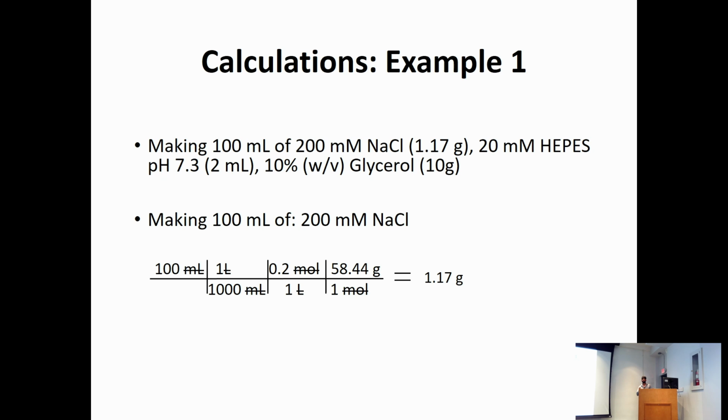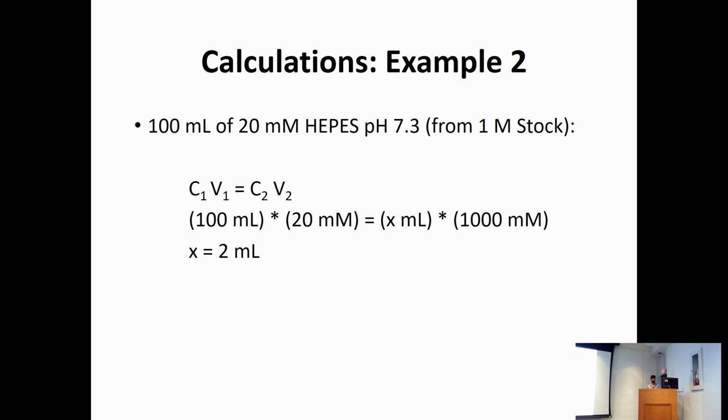You can find out whether it's a problem with the instrument that gave the result, or whether you made a mistake when preparing the sample. Because we have all the calculations, if you've done something wrong here, that's why it didn't give you the expected results. So the calculations are very important to document in the lab notebook. So this is another calculation.